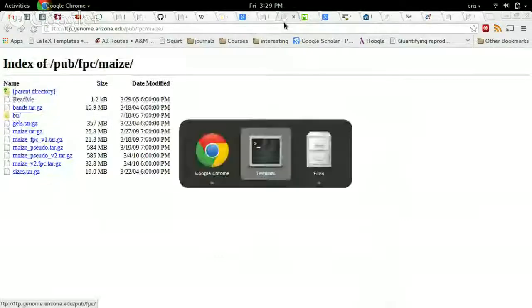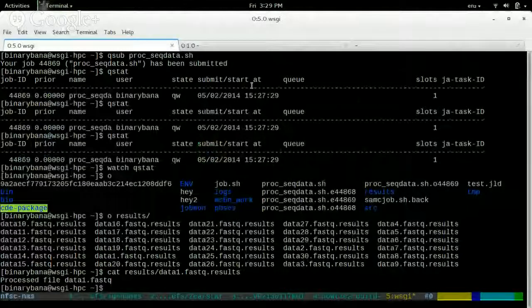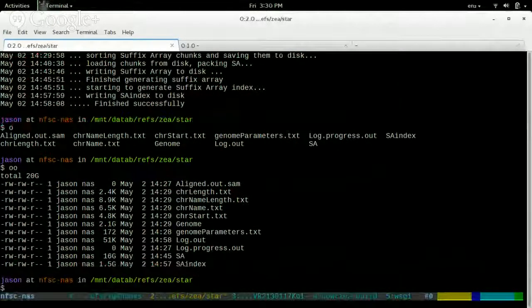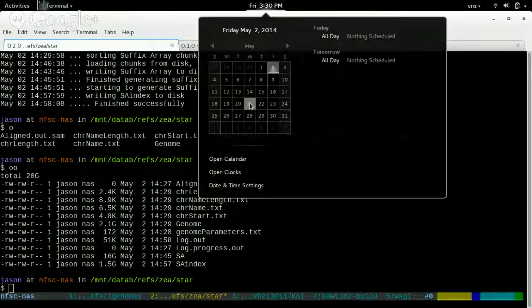And from this point, where we left off here, I basically just built the index. Then you can follow my RNA-Seq tutorial to do the next step, which is the mapping. If you want to get that far, or see how far you can get, then maybe we'll have one more session once you've come to grips. But I am leaving for vacation right after finals, so I won't be back until May 15th, I think. So mid-May.